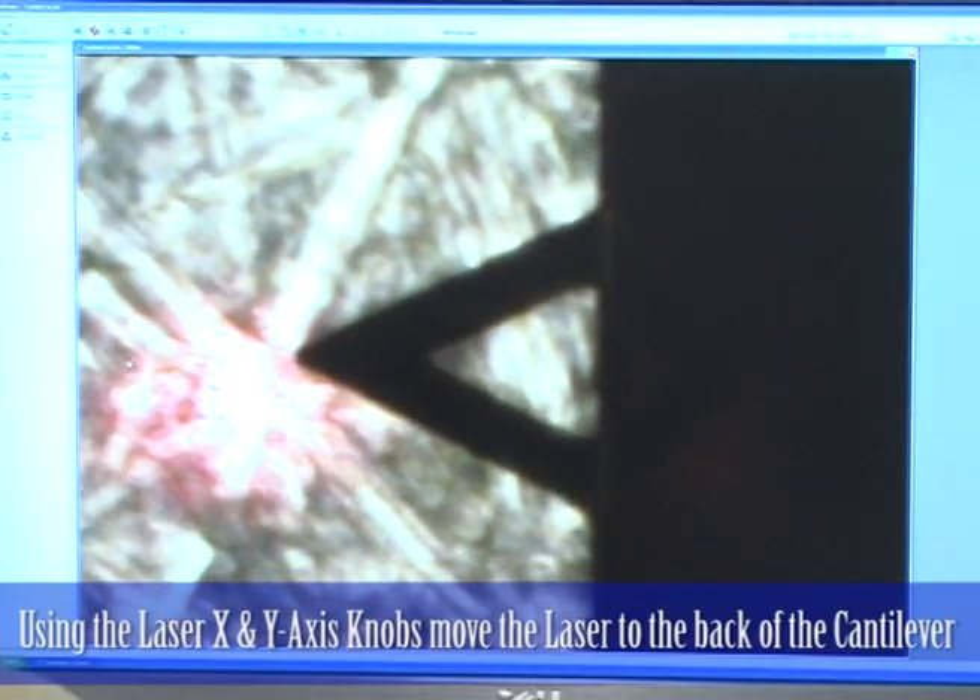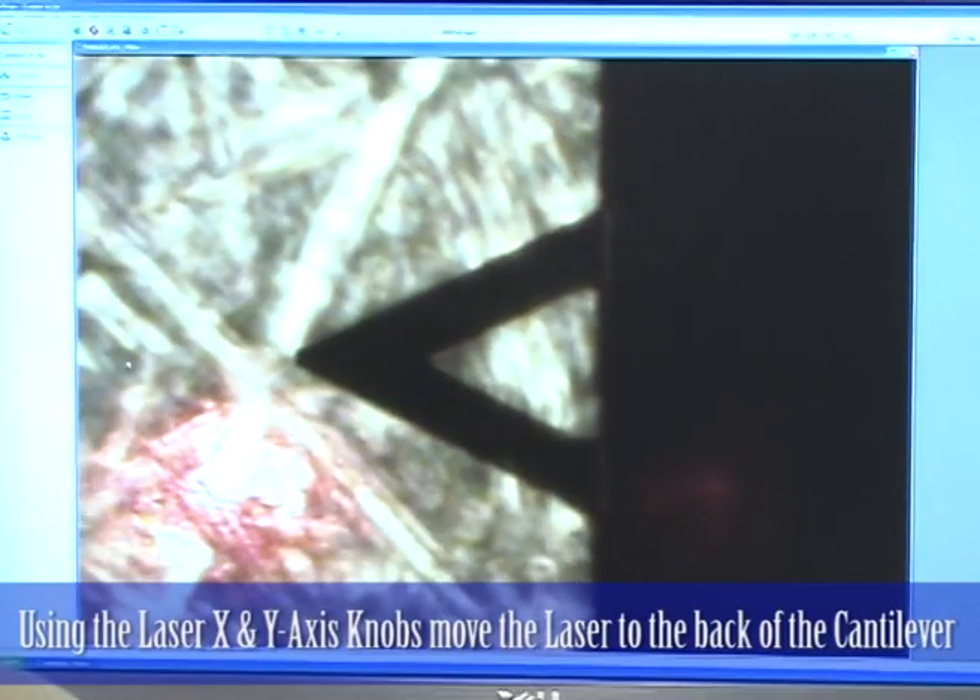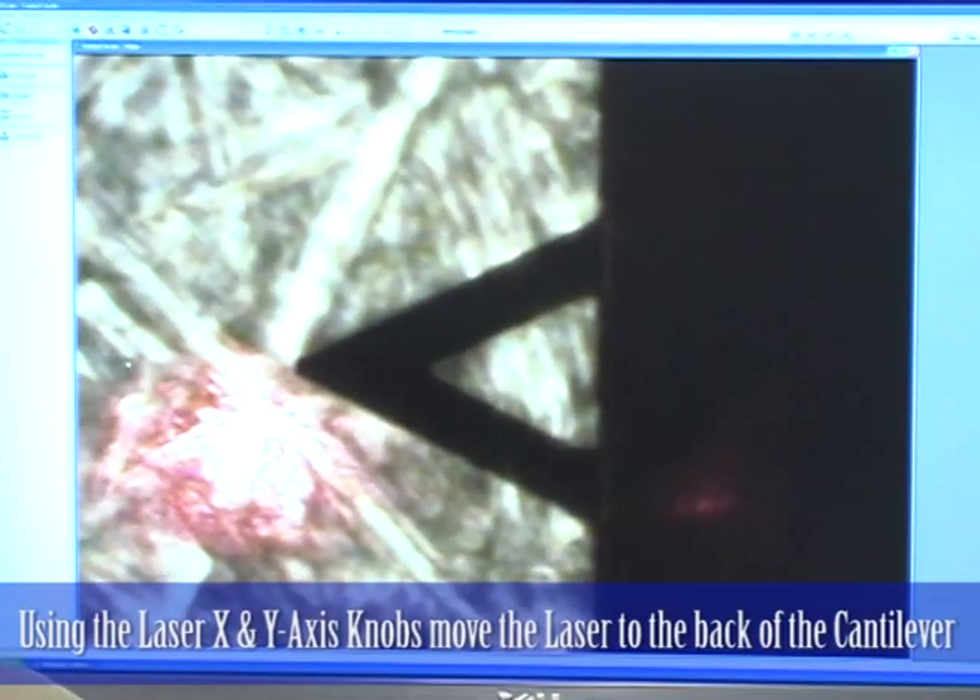I adjust the knobs on the top of the head and I can move the laser up and down, and I can move it left to right. At this position I would be on the cantilever, and this is when I would then start looking at my meter reading and probably adjusting the mirror and then doing the fine tuning.